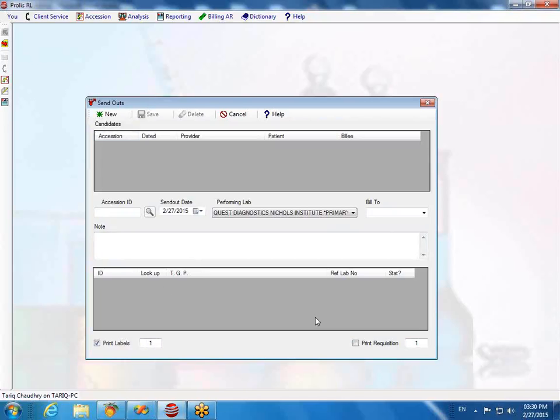We have a pending list also. Actually, it is not just a simple send out list. It's a send out mechanism.